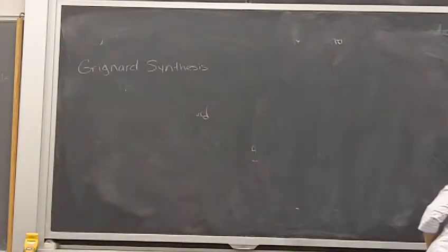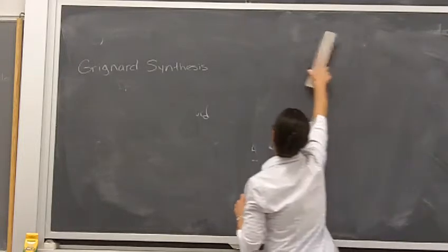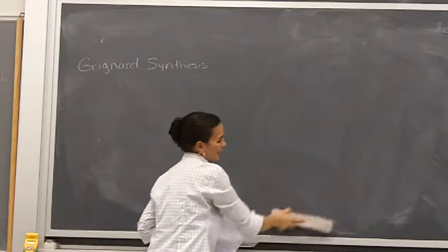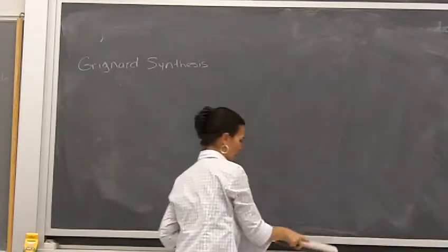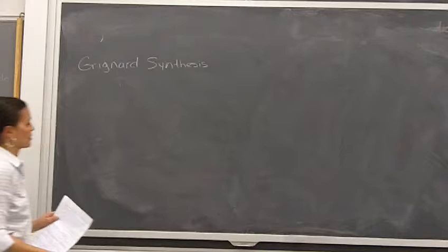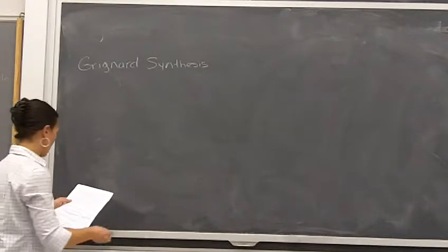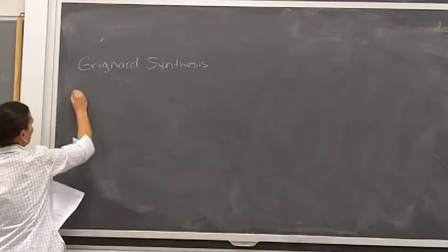Oh, and one more thing with the reagent formation, besides calculating your alkyl bromide, you also have to calculate how much magnesium you need to use, okay? So make sure you've got those calculations. Now, magnesium's metal. What do you want, volume or mass? Mass, okay?